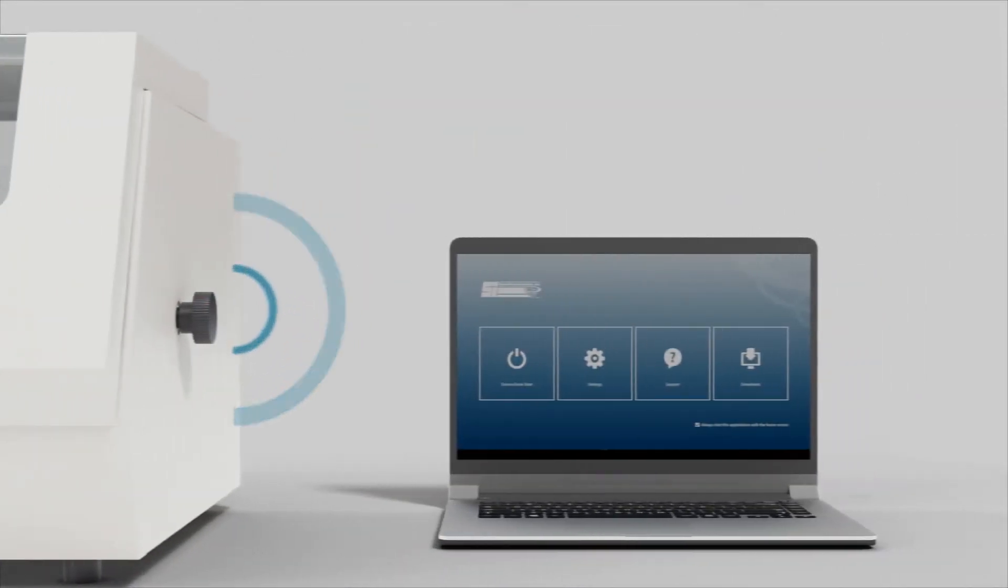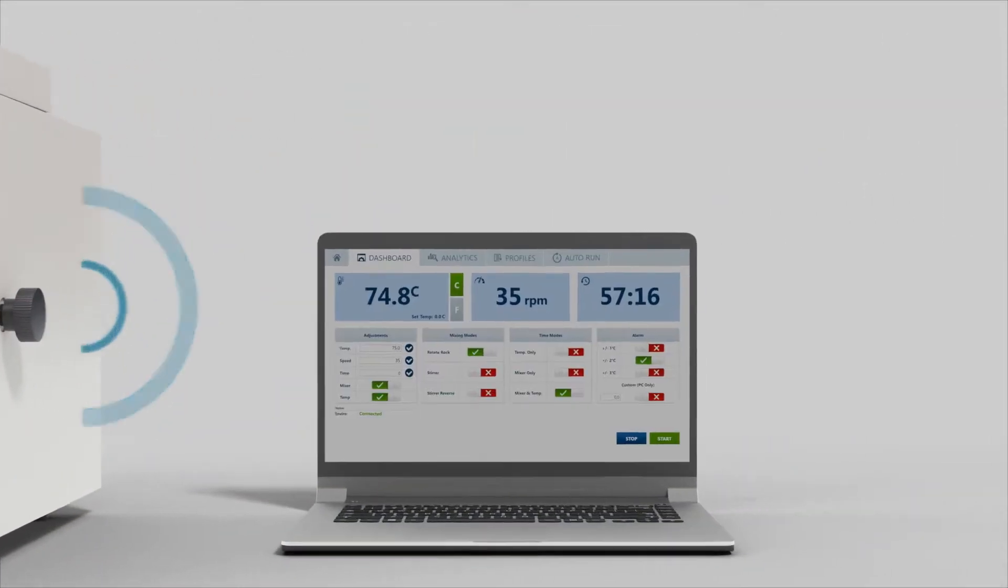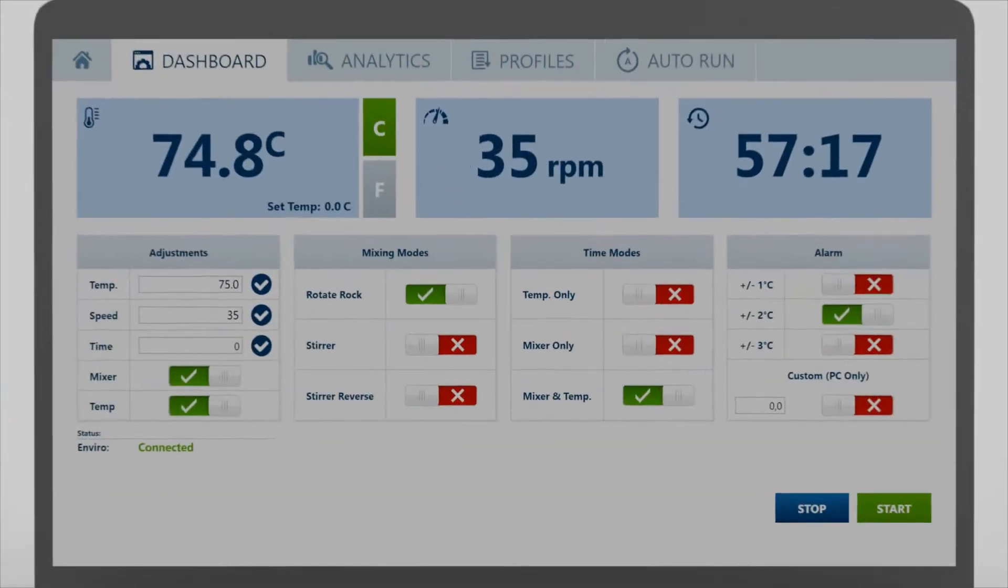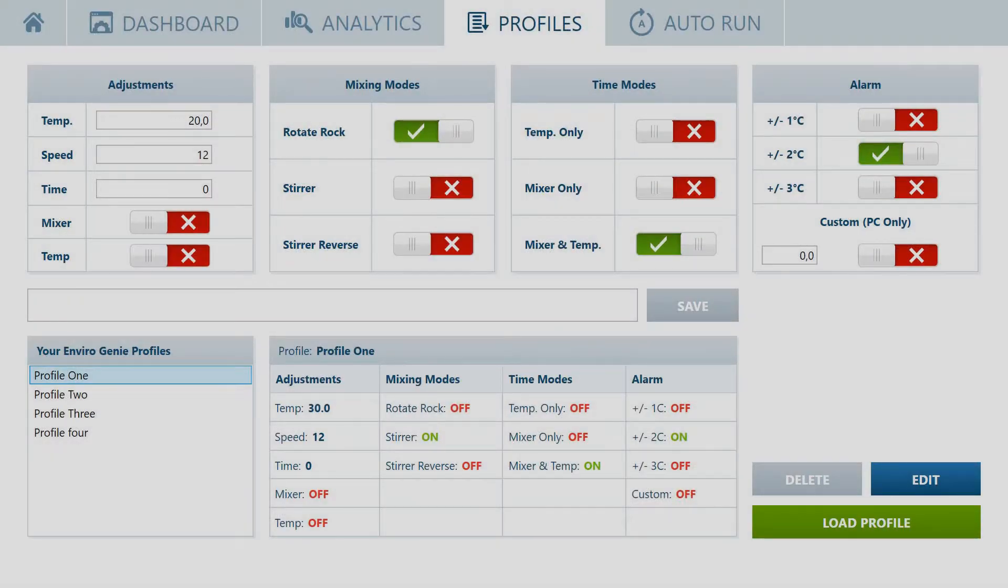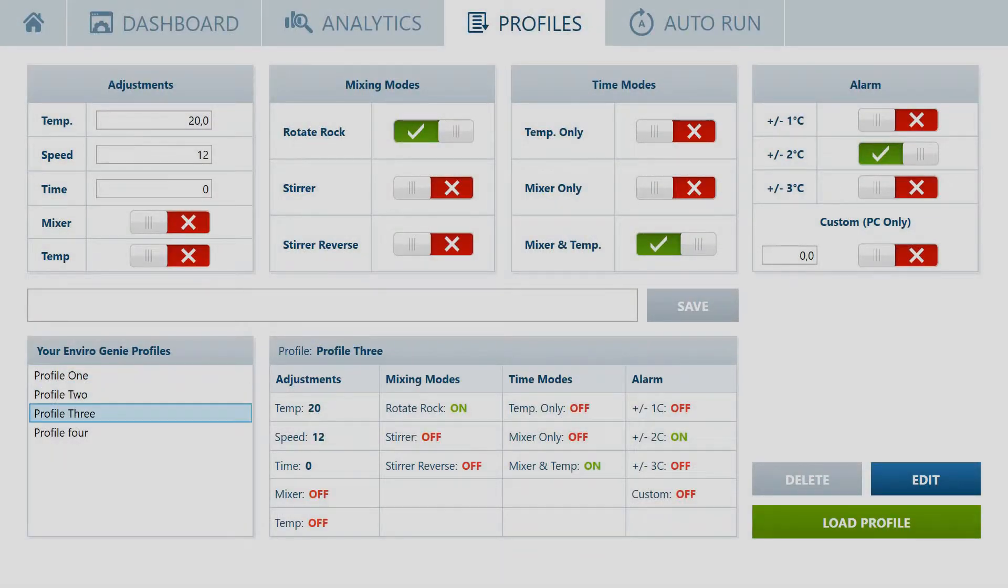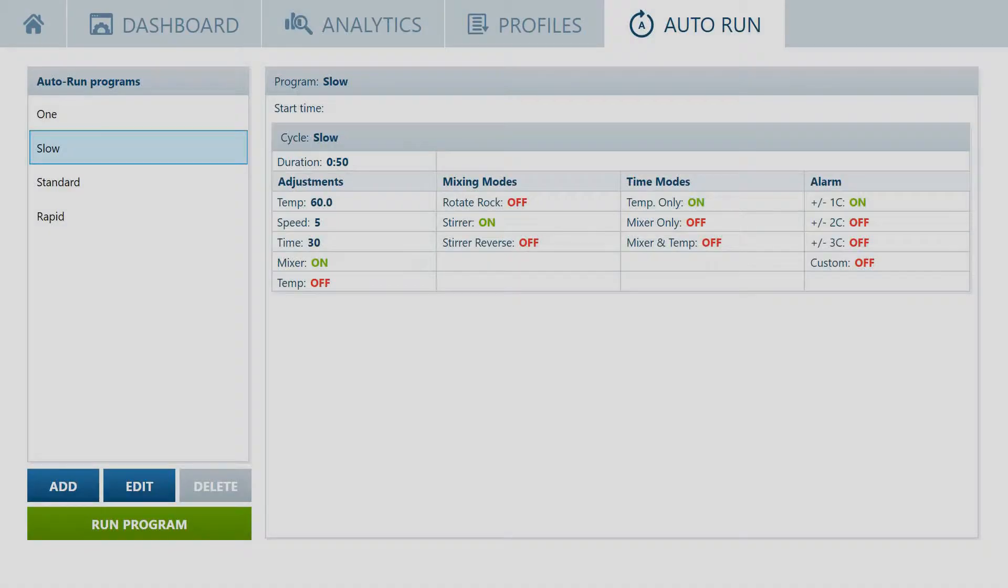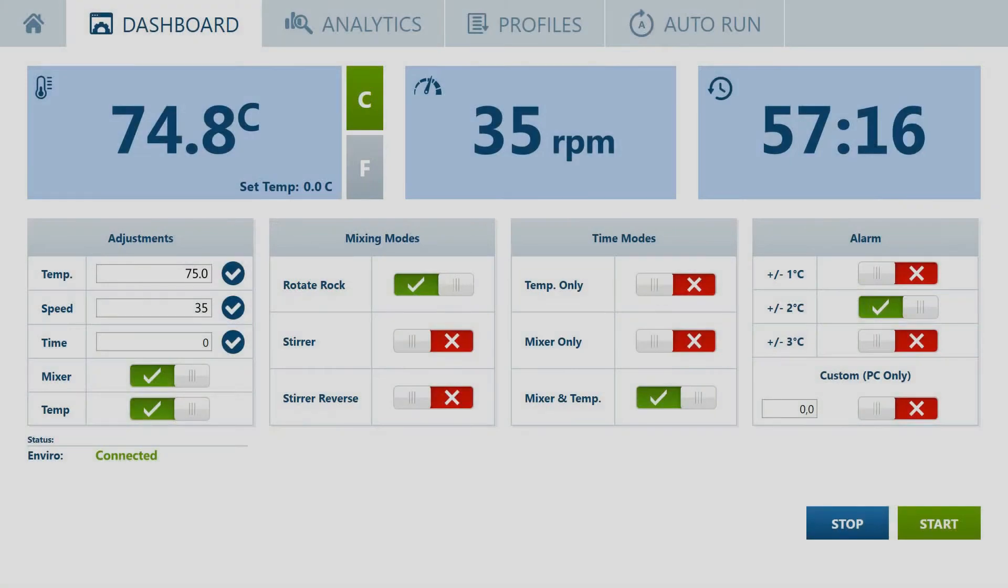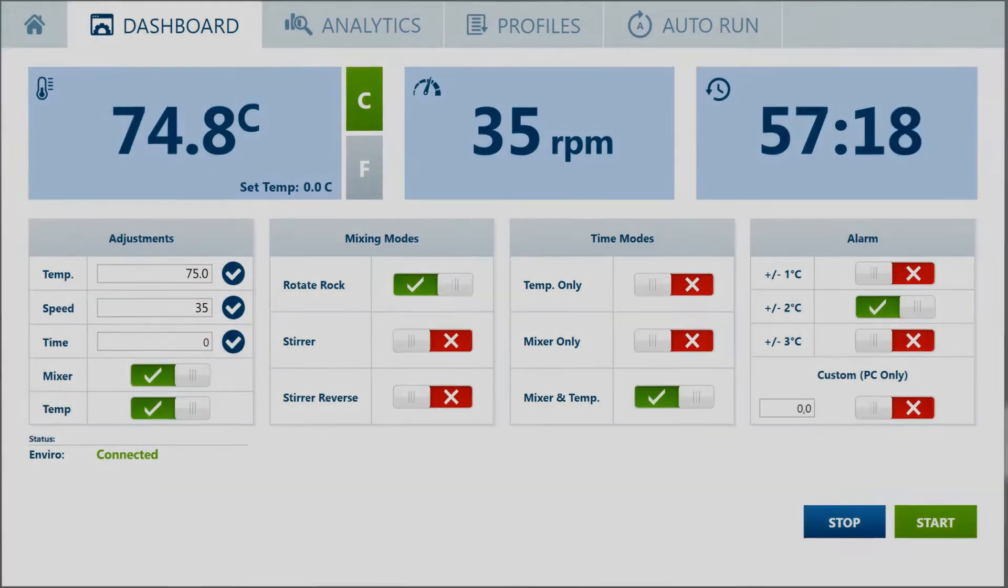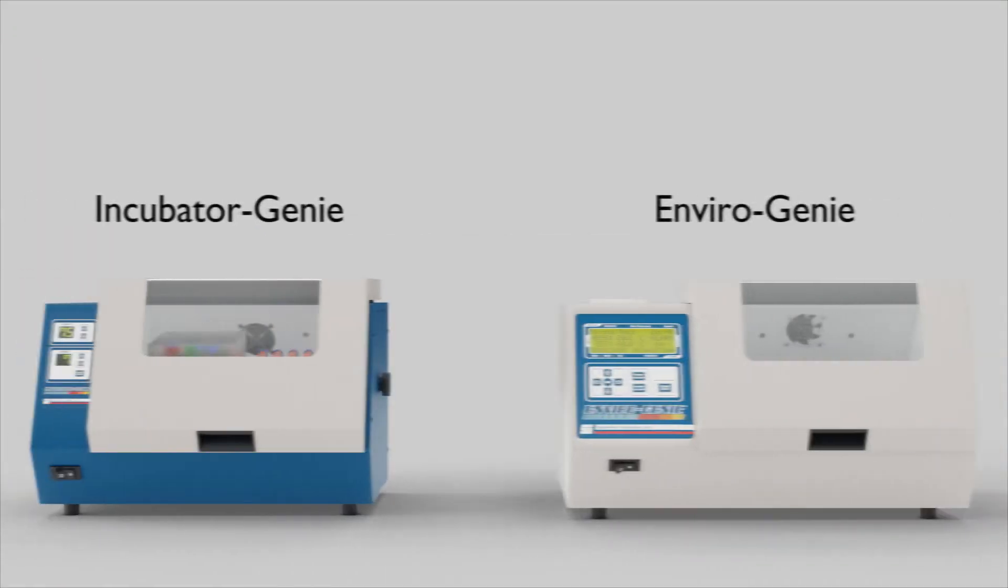Get even more functionality and control with the Enviro app. Save up to 100 incubating profiles of your most frequently used applications. Graph and collect data in real time. Configure auto-run programs with custom cycle times, temperature points and alternating speeds, all from your Windows PC or tablet wirelessly or via USB.